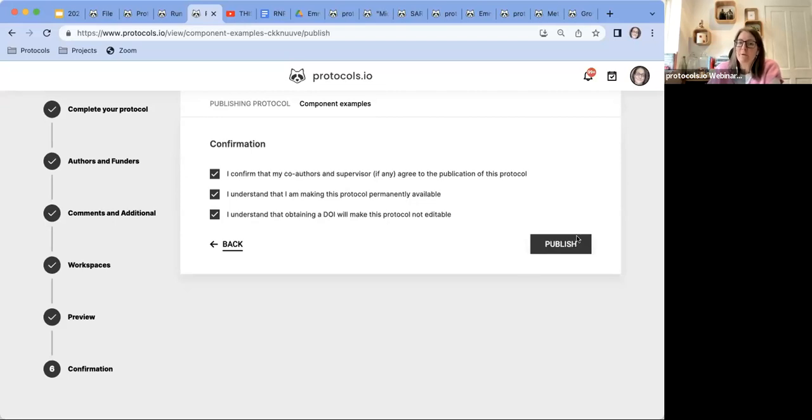If you have a premium account, there is no screening. It happens immediately. If you have a basic free account, it will be screened because we do try and stop spam coming through. Many people want to publish about CBD gummies and random other male enhancements and things like that. So we do screen if you don't have a premium account that we know is trustworthy.